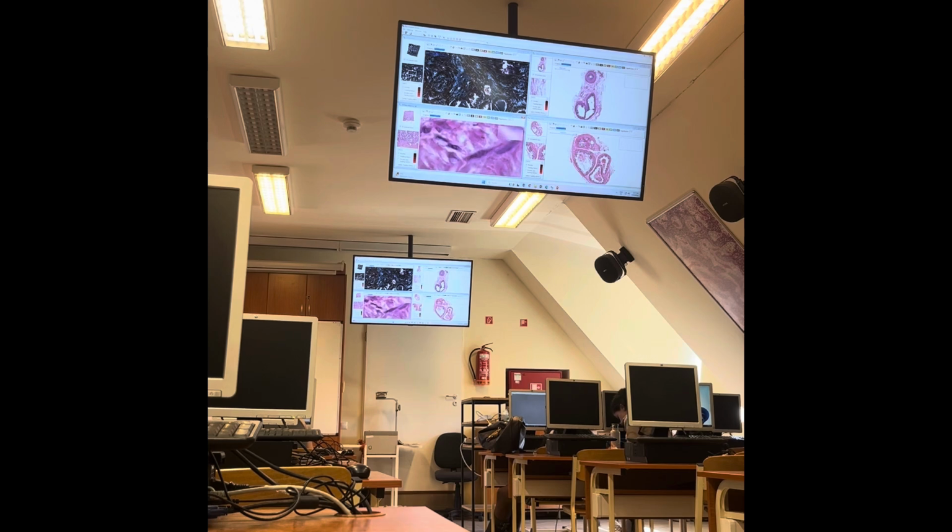If you look at these cells, then on the right hand side you can see two cells with euchromatic nuclei. These are the smooth muscle cells. And on the left hand side, these two have heterochromatic nuclei. These are fibrocytes. Okay, so in this way you can distinguish the two cell types. Alright, so then a few minutes to look at this lesson.